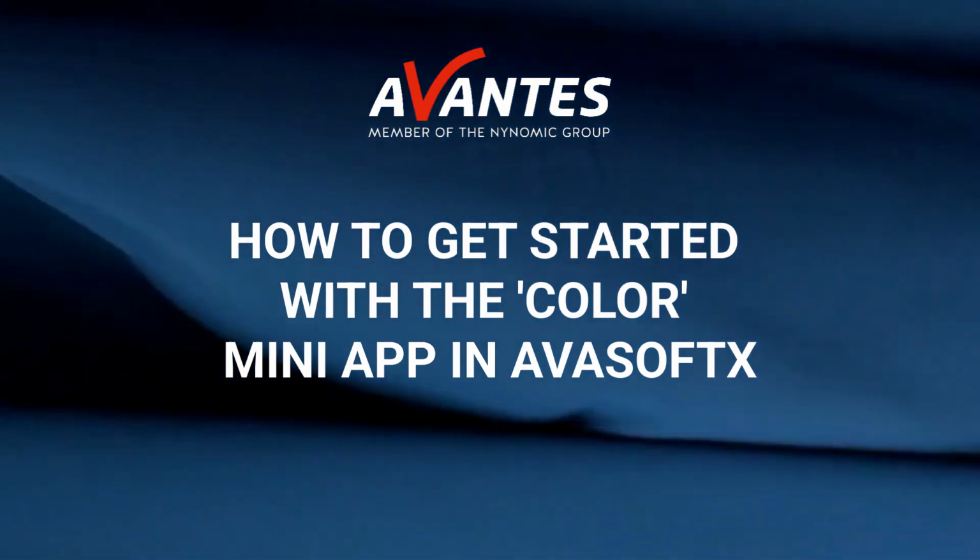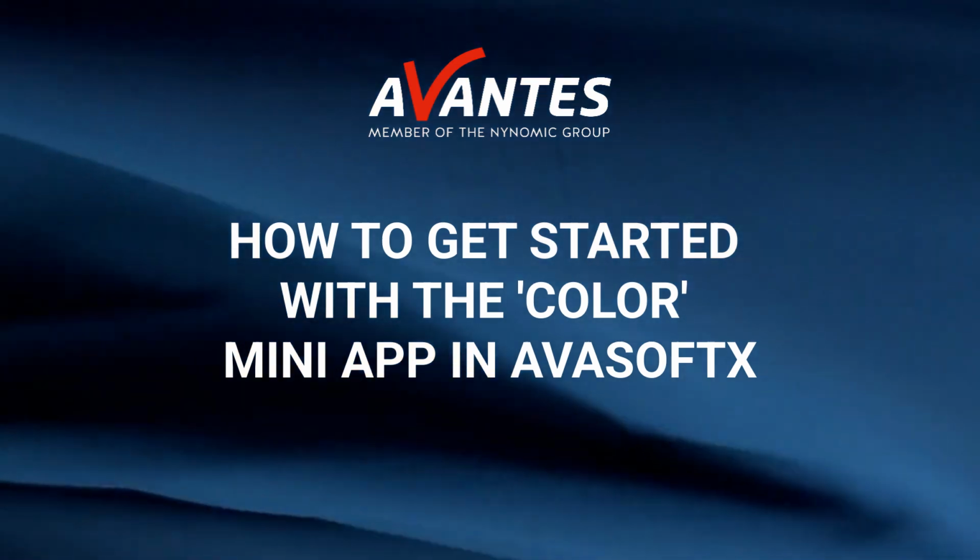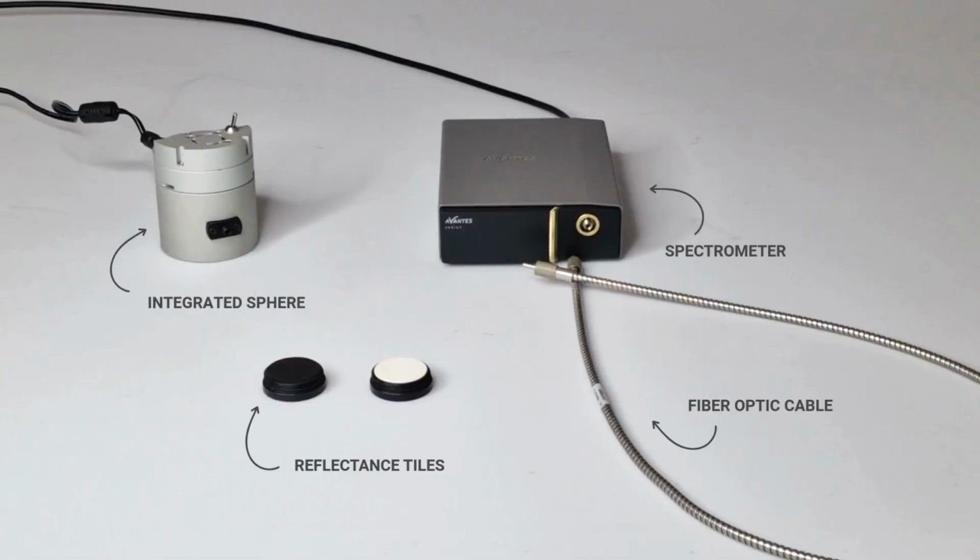In this video, you'll learn how to connect your spectroscopy setup with the Color Mini app in AvaSoftX. You need a spectrometer, an integrating sphere with a built-in halogen light source, and a fiber optic cable. Absolute color measurements require calibrated white and black reference tiles. Alternatively, you can record a dark spectrum with the light source turned off and using an uncalibrated white tile for relative measurements.